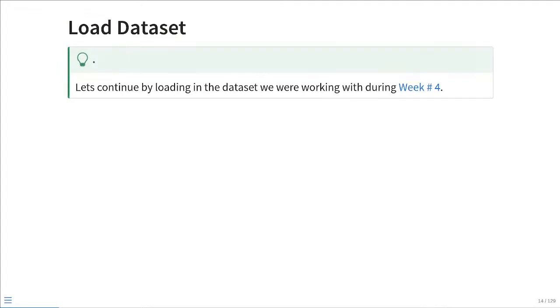So, continuing where we left off, during week 4, we were looking at a tidyverse data set, basically seeing how we could mutate, we could select, we could filter different rows and columns. We'll be continuing with most of that data set for today when we're looking at ggplot2 objects. And then at the very end of today, we'll look at the week 5 data set where we loaded in a FlowJo workspace to R as a gating set via the CytoML package. We'll bring that data set in and reuse it when we're looking at how to do the cytometry style plots.